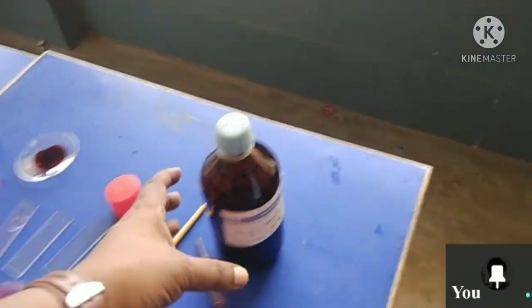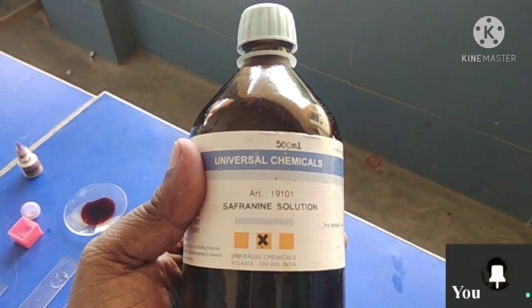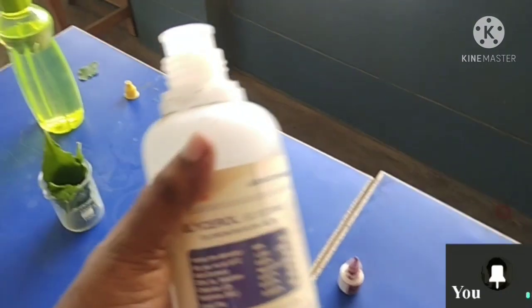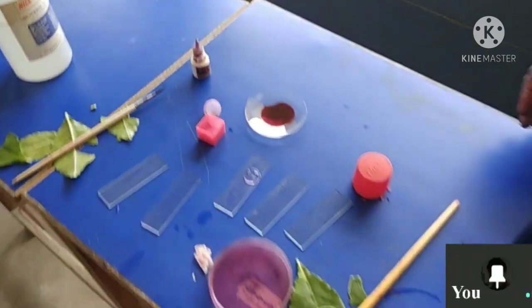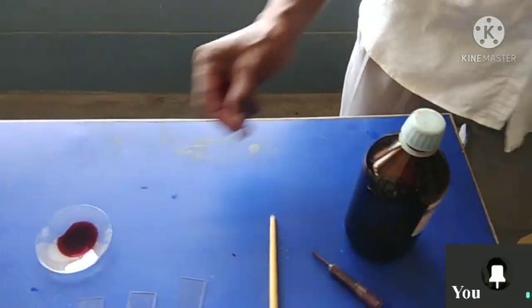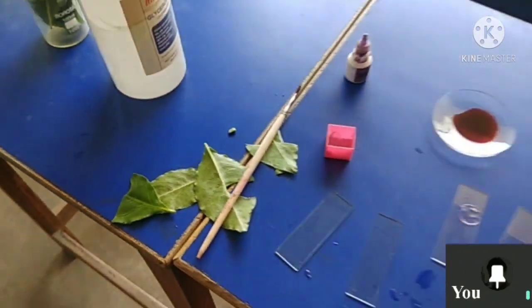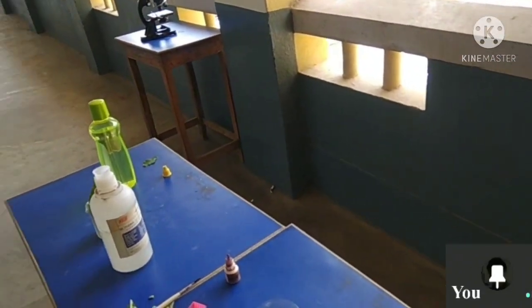So everyone saw that. Now you just learned: the staining material is safranine — write this name in your copy, S-A-F-R-A-N-I-N-E, safranine solution. With glycerin you have mounted — that is glycerin mounting, which is temporary mounting. Other things you used: a brush, a cover glass, a blade to cut, a watch glass, and the leaf. For the leaf, no need to write the scientific name — just write dicot leaf.